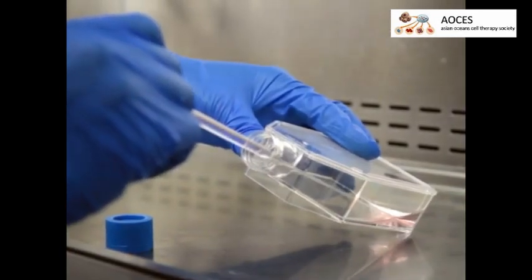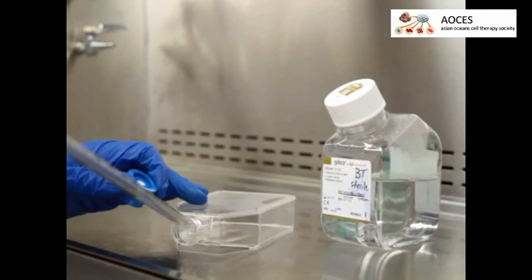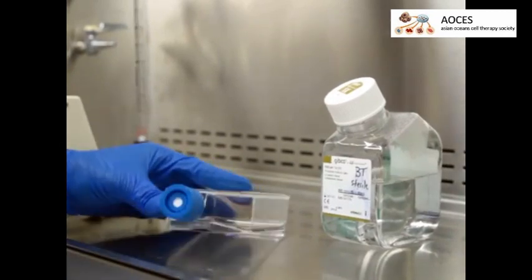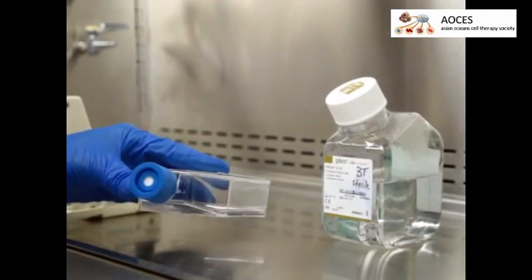Gently aspirate the culture medium and then wash the cells twice with PBS. The magnetically labeled cells can now be used for experiments.